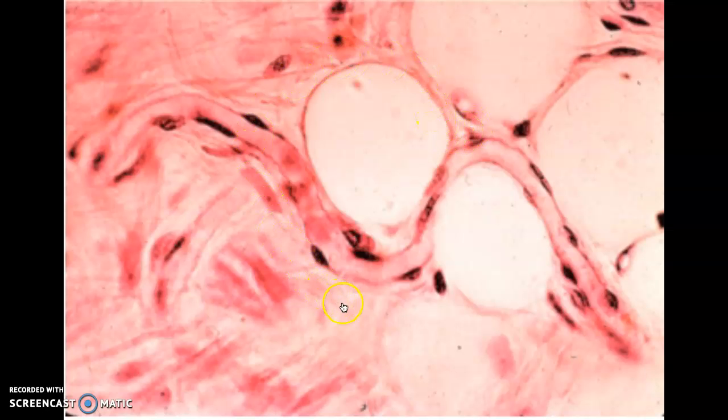This permits a single red blood cell to pass through them. The capillary endothelial cells vary in structure depending upon the tissue type in which they are found. Continuous capillaries are the most common, for example, in muscle, fat, or nervous tissue. They have no transcellular perforations, and the cells are joined by tight, non-permeable junctions.